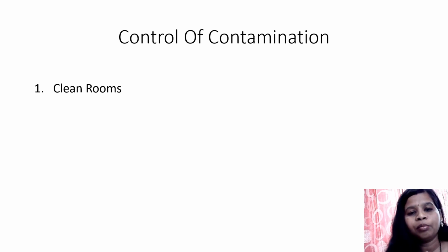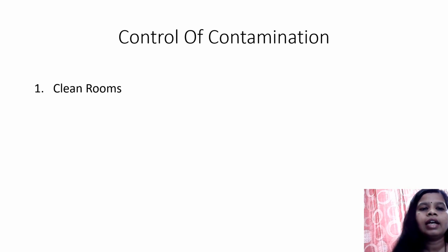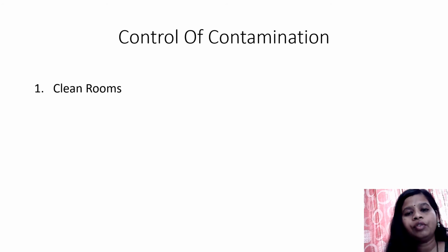And most important, the entry into the clean rooms should be prevented or controlled. Only a few people, the higher authorities or the personnel who are allowed in this particular area, are the only ones having entry into the clean room. So by this we can have control in the clean rooms.